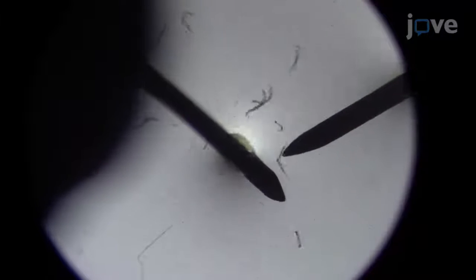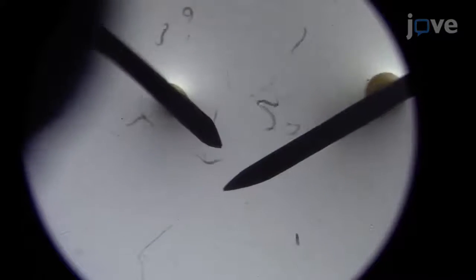Use the sharpened tips of 18-gauge hypodermic needles to slice each animal transversely at the mid-body to release 1-4 cell embryos.